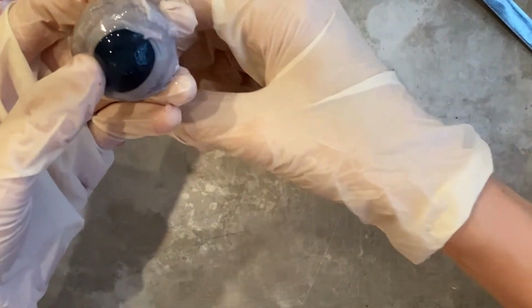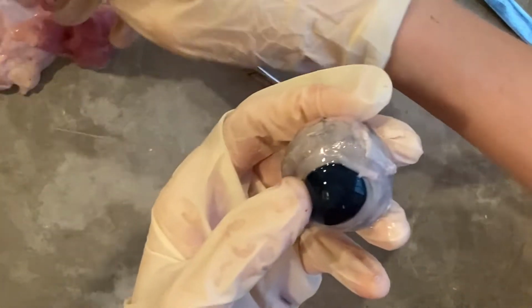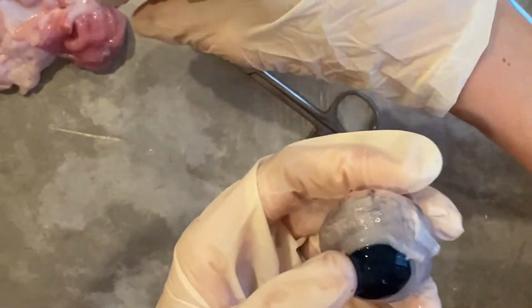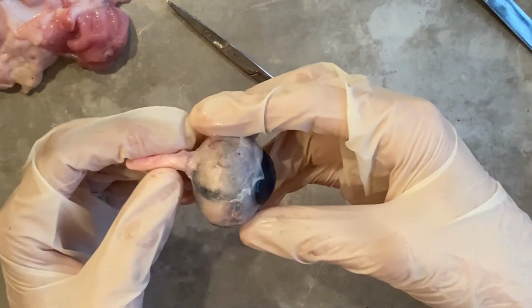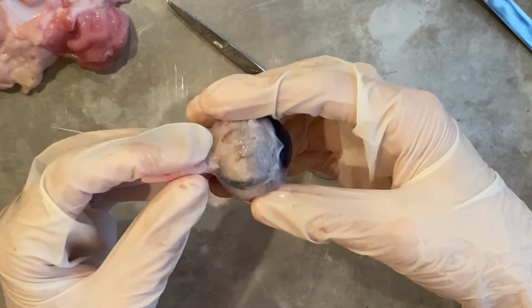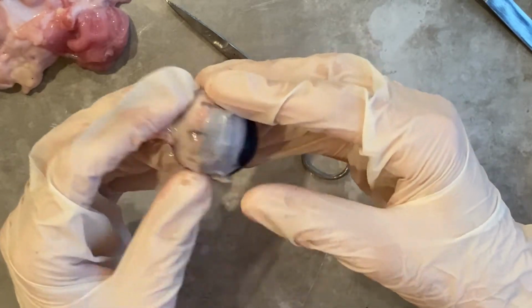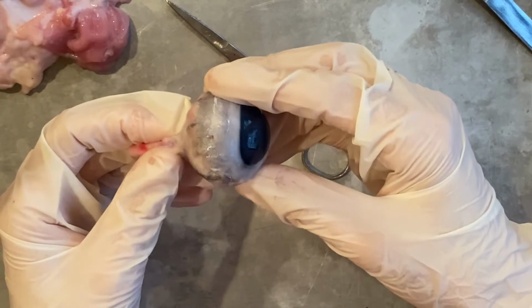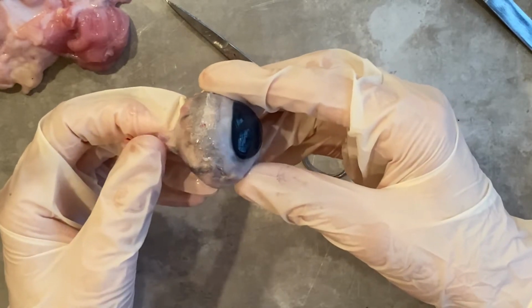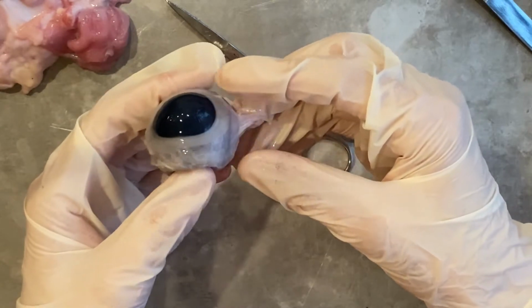We remove the fat. Stuck on the back of my glove. We remove the fat, and then we have removed the muscle, the rectus muscles around the eye. So now we are going to divide the eyeball into anterior and posterior portions.